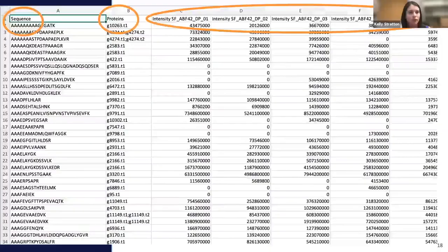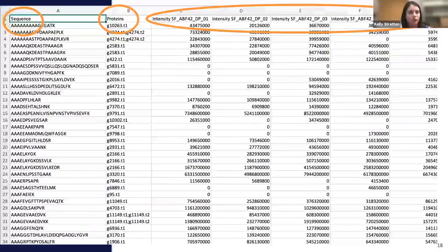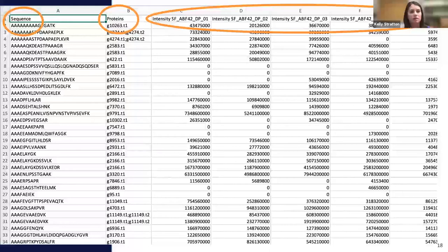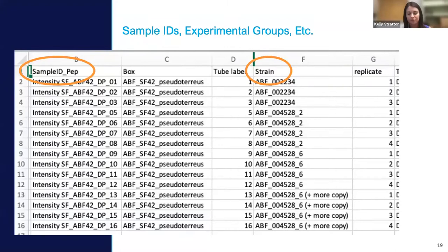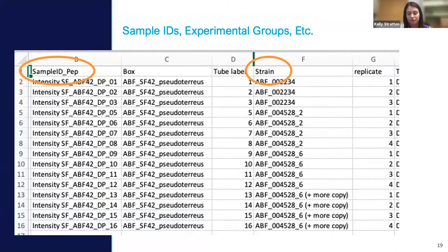This screenshot shows the proteomics data. The circled column at the top is the peptide sequence column, followed by the protein mapping for each peptide, and then sample names across the top. Those sample names match exactly to the sample ID column in the metadata file, and those samples are mapped to the strains.